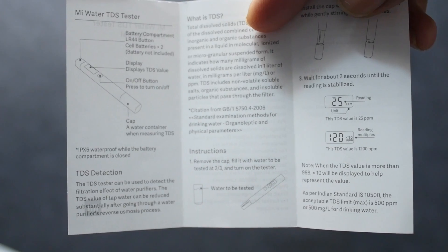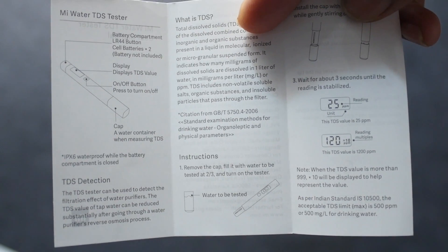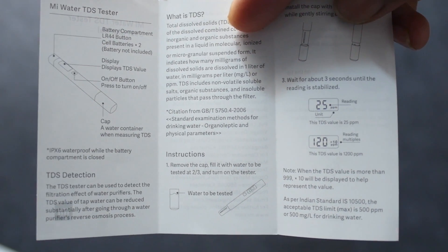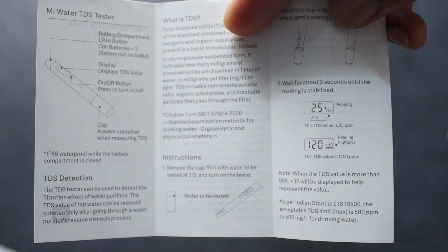The display shows 3 digits. The meter officially supports up to 9,990 PPM. Normally it displays 3 digits, but when the value exceeds 999, it multiplies by 10 — so 999 x 10 equals 9,990 PPM maximum range.